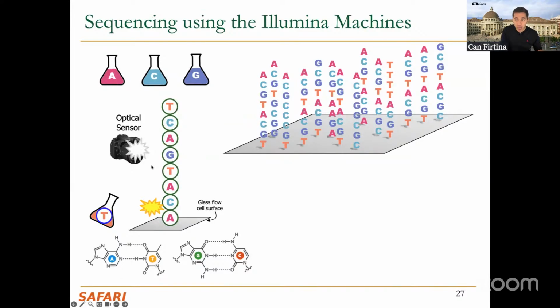But it may so happen that due to wrong washing, for example, we won't be able to wash all the necessary chemicals, or maybe we will wash too harshly, so that the synchronization between the duplicate copies will be disrupted. So maybe when you reach 200, some of the copies will reach 220, some will reach 180, but most of them will still be around 200. Then you can still take a consensus and be confident that we are at the 200th cycle. Some information tells me different color information, but most of the time, we have a consensus.